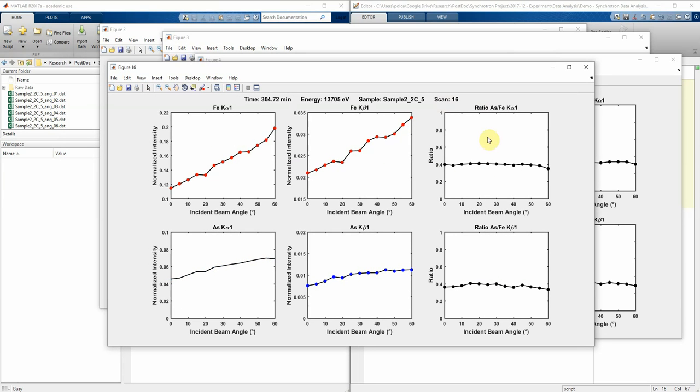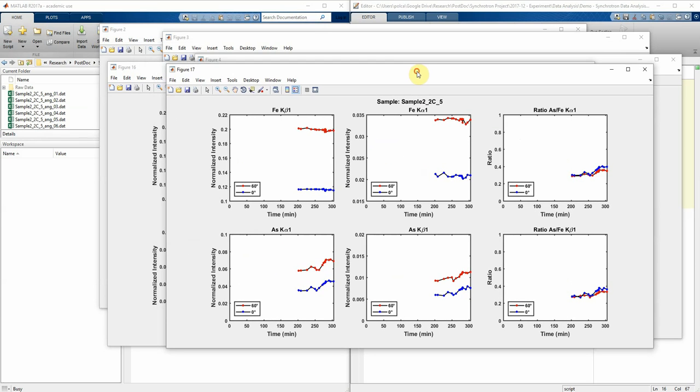So now it's done it 16 times. The last part it has to do is the comparison over time. And you'll see now for the 16 points, and there's the chirp sound. So now we know that it's done.